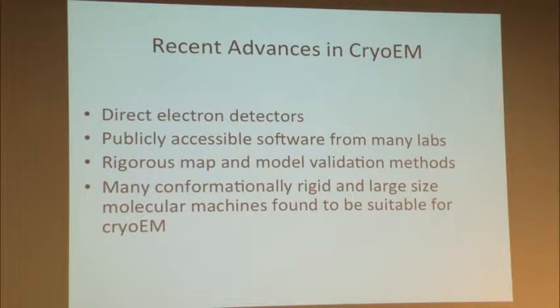And I think that really provides the community open source code that they can readily use when they have the data. And the third one, that I think became more important in the last 2 years, is that we have developed more rigorous computational protocols to validate our structures. I think in the next few minutes, I'm going to show you how we do that.